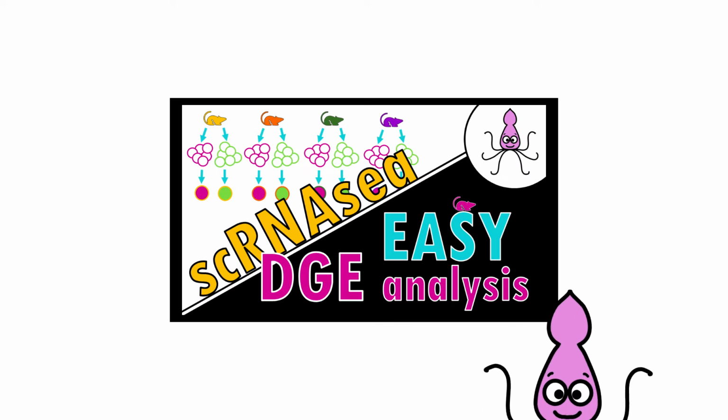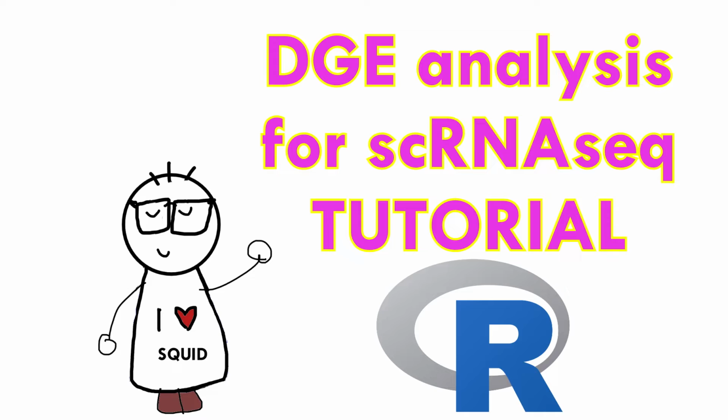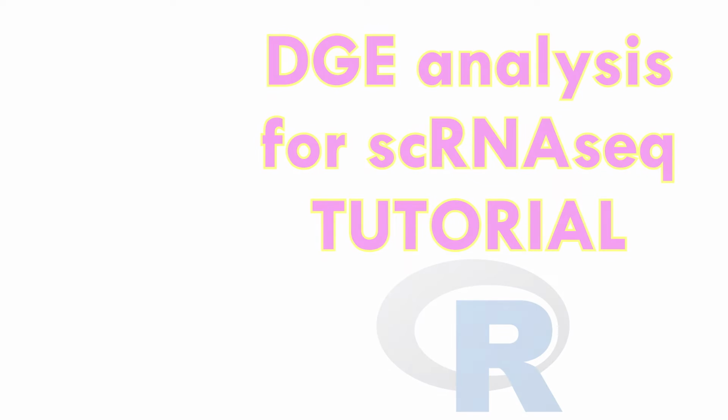In my previous video, we covered the basics of DGE analysis for single-cell RNAseq datasets. Now it's time to put that knowledge into practice with a hands-on tutorial in R, where we will perform both differential gene expression analysis and data visualization. So if you're ready, let's dive in.